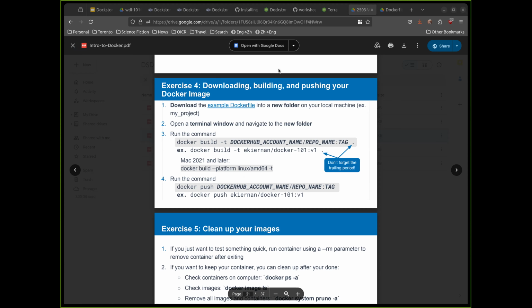But then the new build did not have this, what is it called, the libncurses5, and I just added this line at the top. I could either use a different base instead of the conda base container to install SAMtools, or I could just keep it the same and just add this libncurses5.